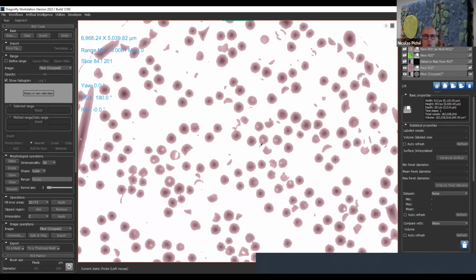So I will grow my region of interest in the inverted distance map using the mask, the purple mask that we're seeing now, so that it doesn't need to cover the white. It just needs to cover all the pink and separate those two objects, for instance. And we see that these two objects have specific seeds in them.